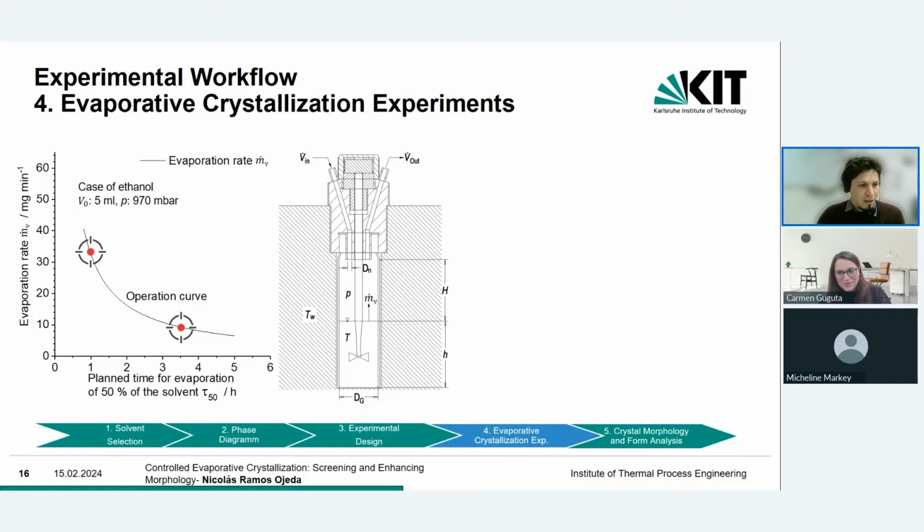And the samples, as I said before, in the experiments performed in Crystalline, everything is performed and measured in Crystalline. Just the analyses are performed after the experiments with a separate script.